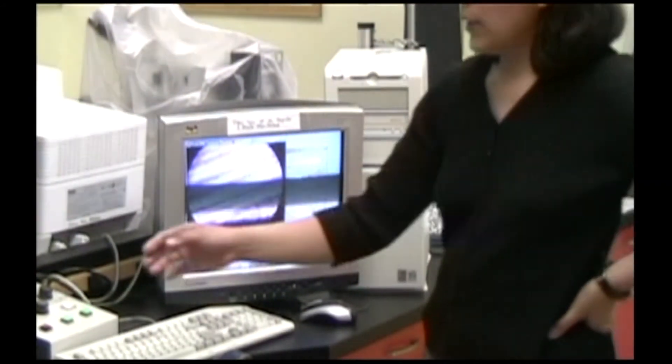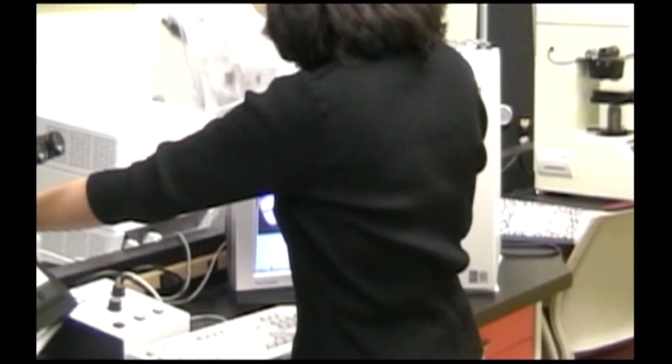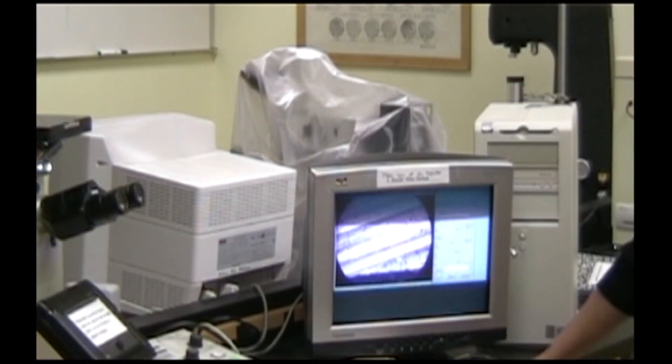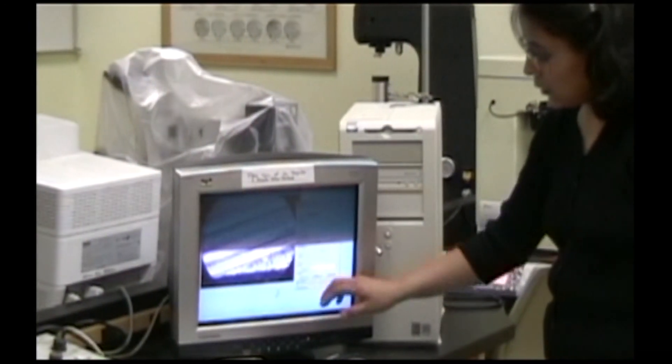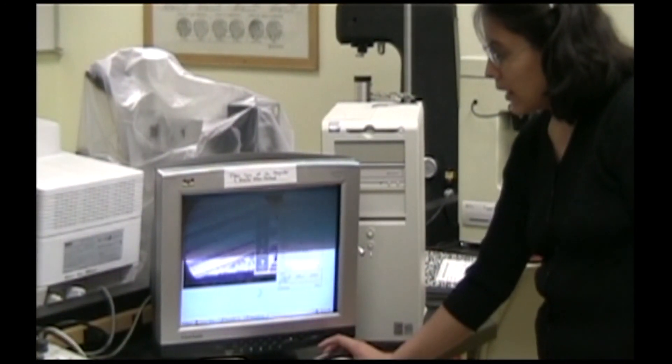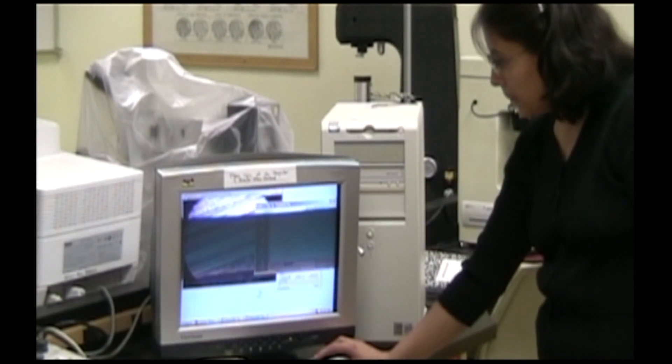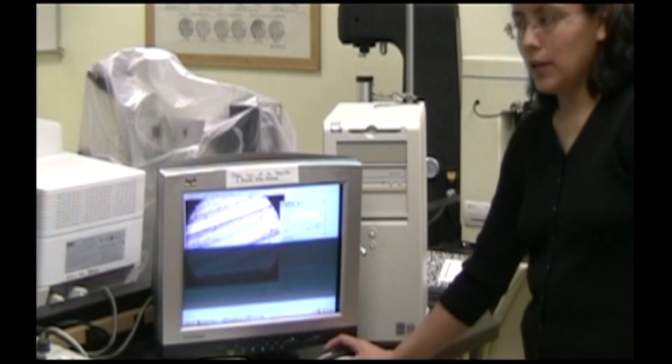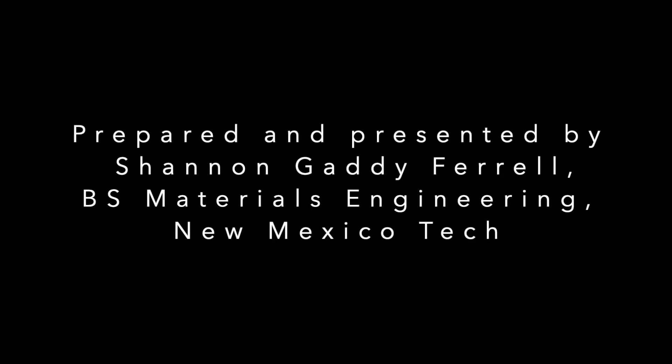This image is blurry. You can fix that by adjusting the fine focus knob while looking at the computer screen. When you're satisfied with this image, you can choose save as and tell the software where you would like to save your file. Click snapshot so that it will actually save the image to that file.